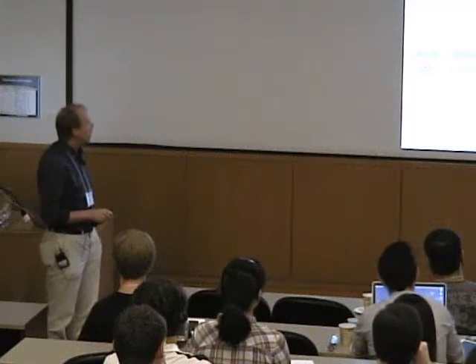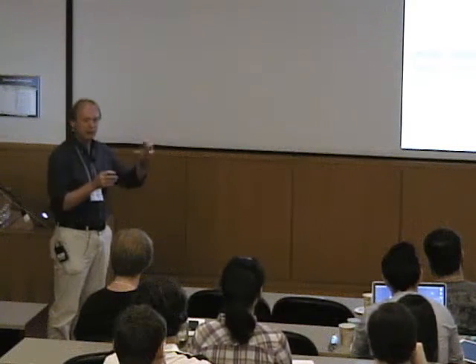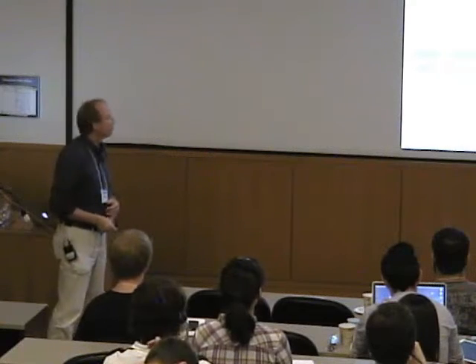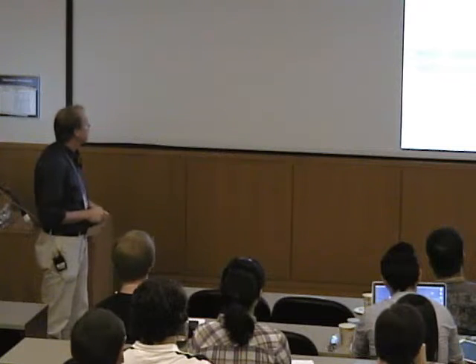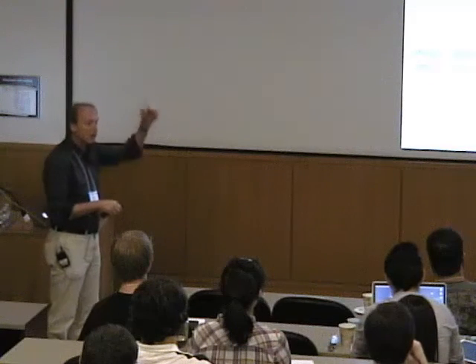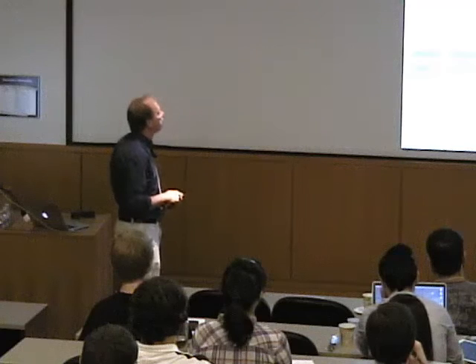But the dispersion of the light, if we just had our source and our sample over here with a microwave source, the dispersion of the light is way too big. So unlike a light beam, we can't direct it in a particular direction. And so the way that we get around that is to use these waveguides, right? And this is a resonator, basically just a box, and then there's a holder at the top and bottom that will hold the sample in place and put it into the middle.